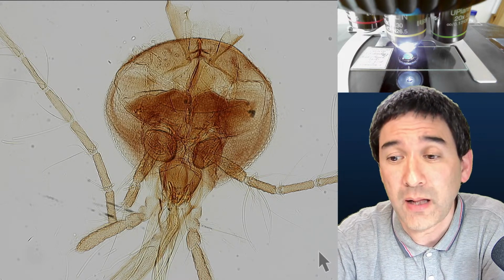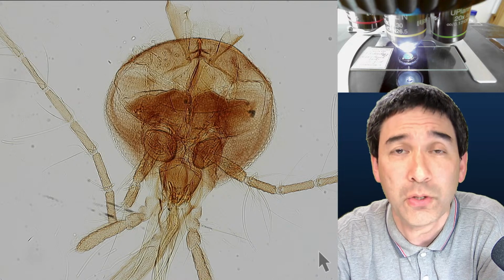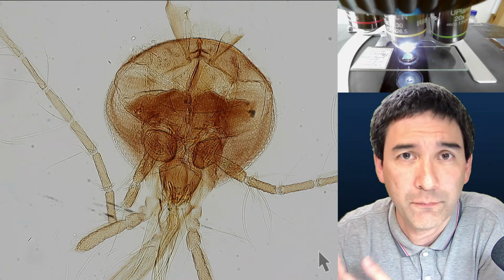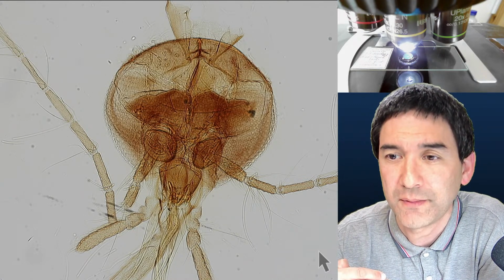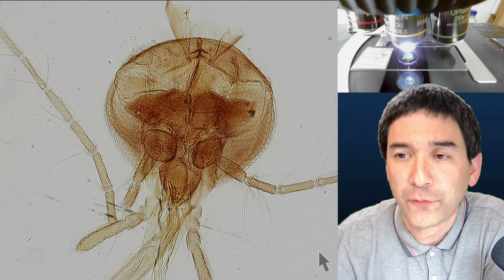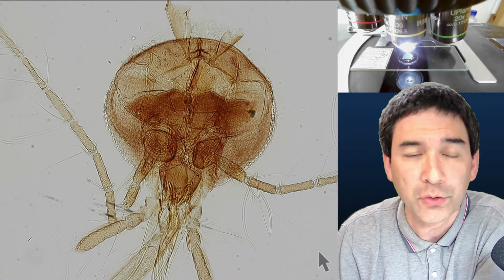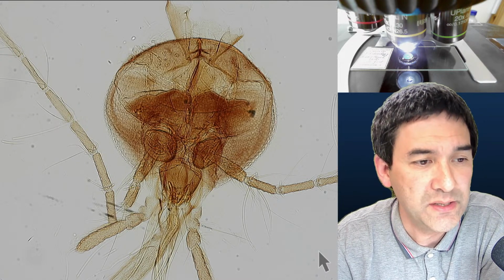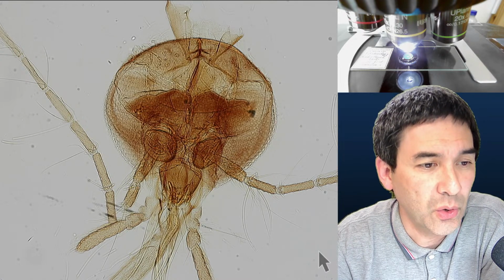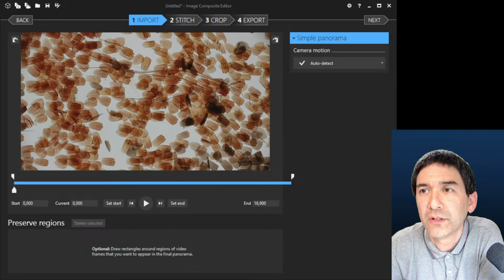I'm going to do this in real time, so there is a little bit of waiting time necessary because it takes some time for the computer to process this. I will do that first, and then I'll get to the other questions here that I'm hopefully not going to forget. But let's do this. Okay, so where is this one over here? Yes, okay, I'm going to quickly show you how this works.